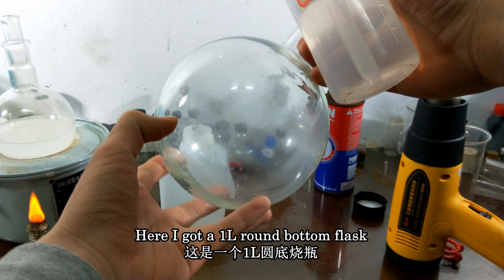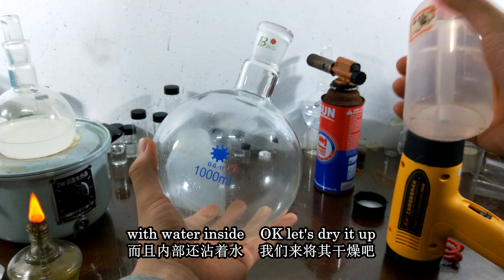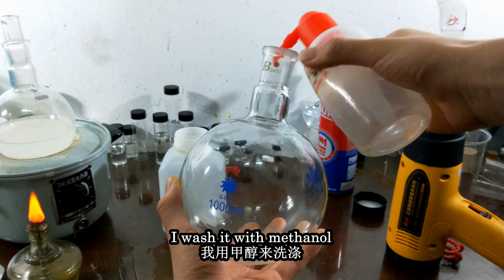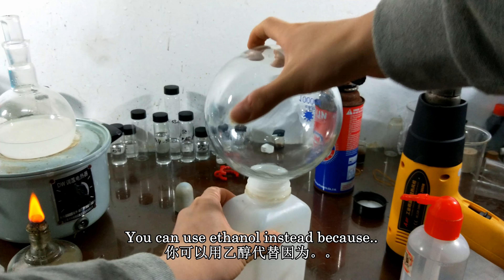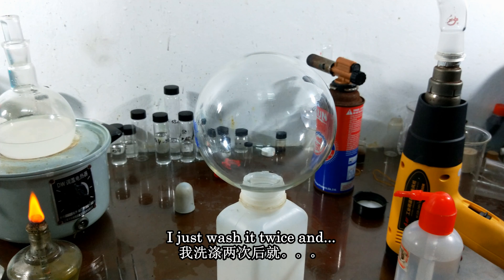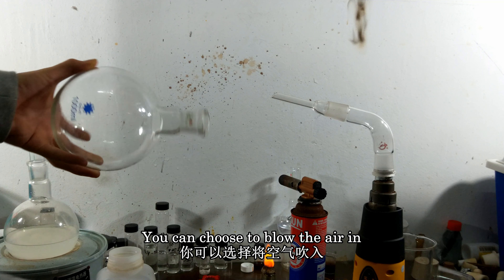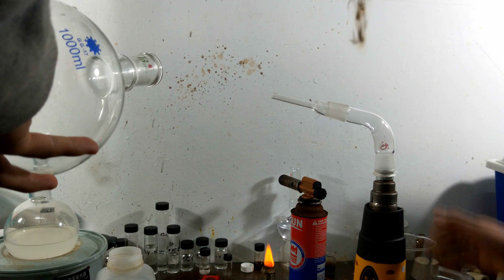I got a one liter round bottom flask with water inside. Let's dry it out. I wash it with methanol. You can use ethanol instead because methanol is a little bit poisonous. I just wash it twice, and you can choose to blow air in to evaporate all the methanol.